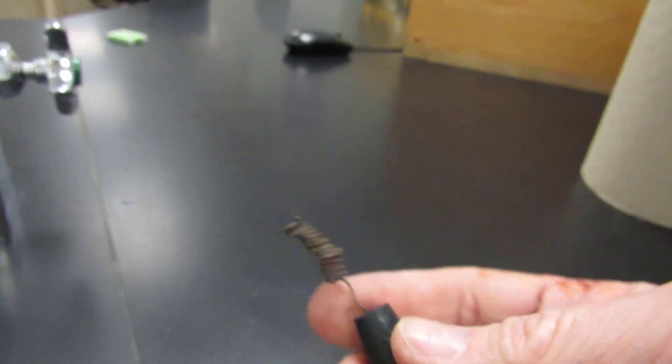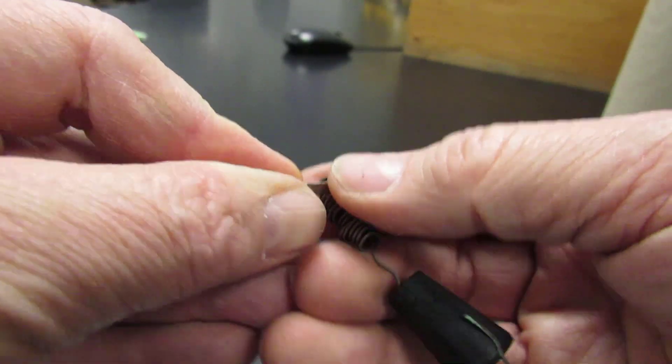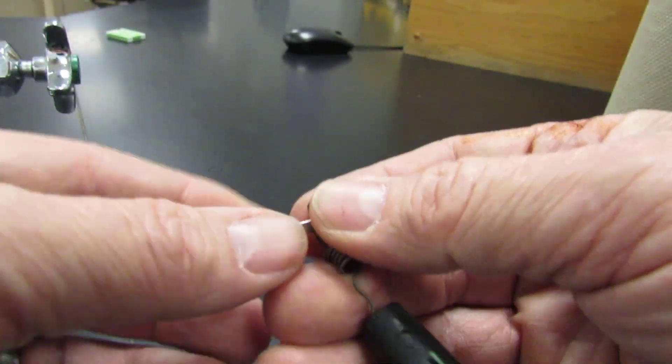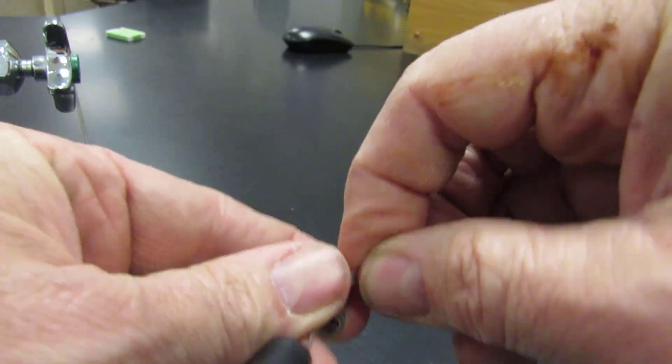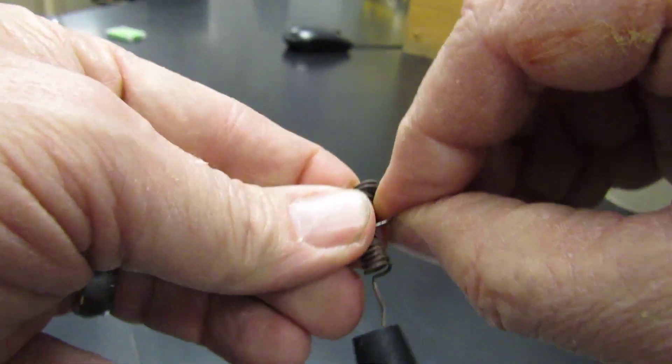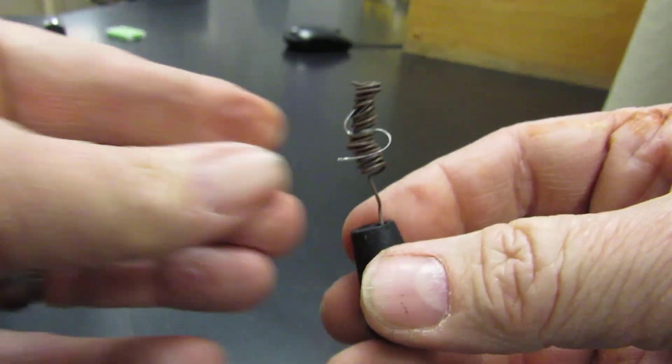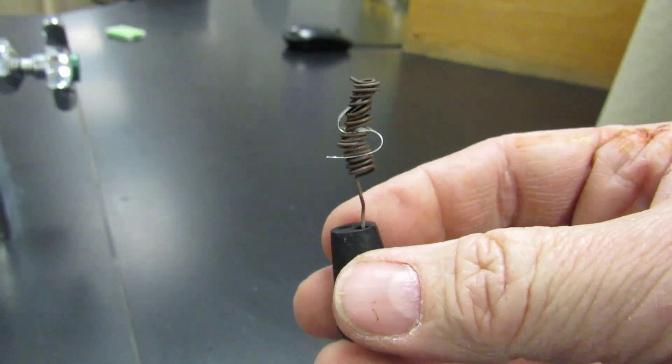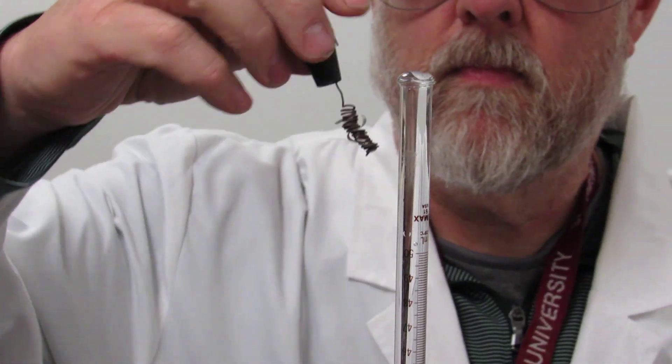Now here's the hard part. You're going to put your piece of magnesium into the wire cage, so you're going to stuff it into one of the little openings. Then you're going to bend it until you can stuff it in again, and then bend it again like an S until you can stuff it in again. You keep doing that until the entire piece of magnesium is in there. It'll look something like that.